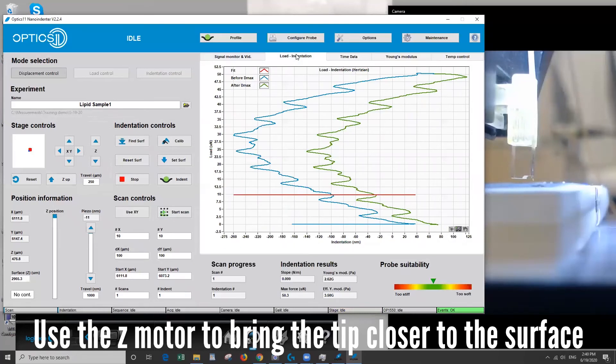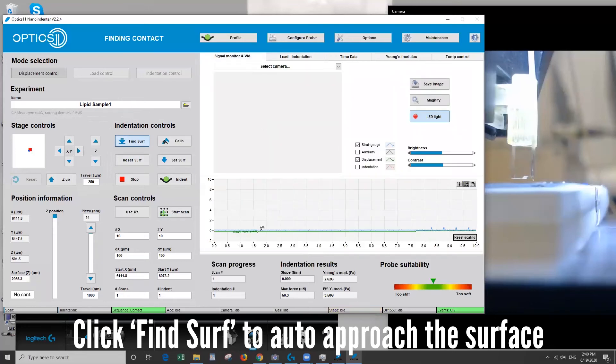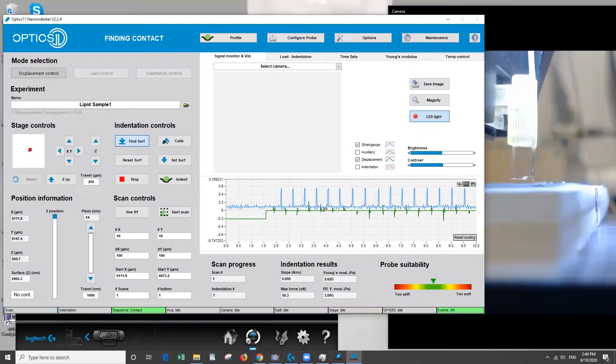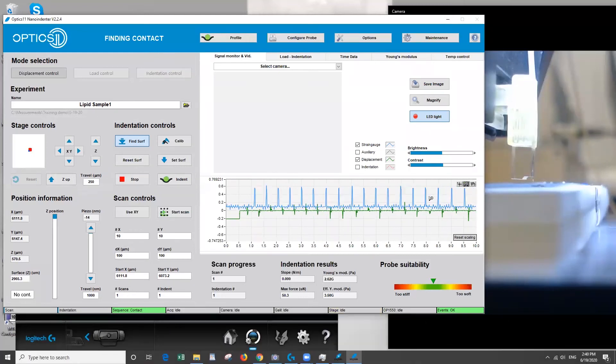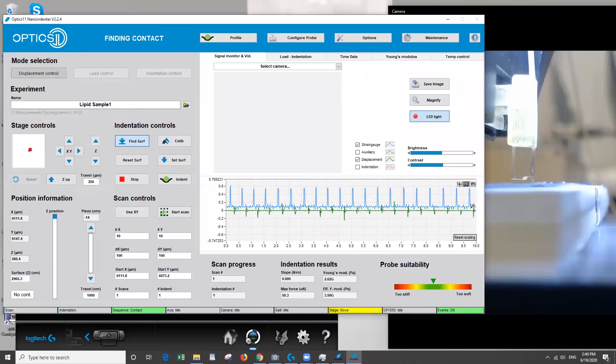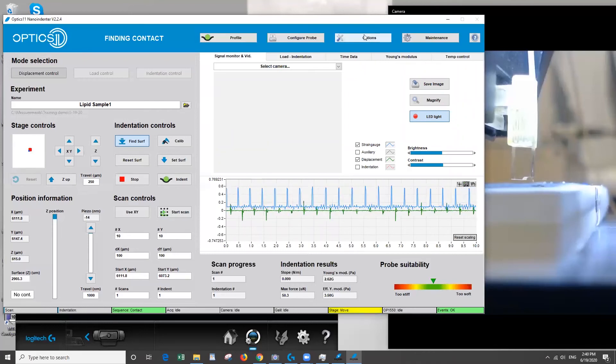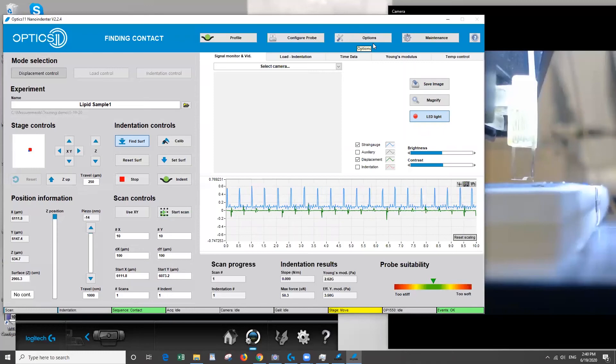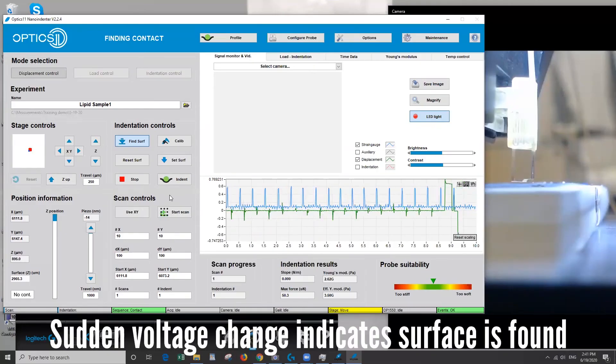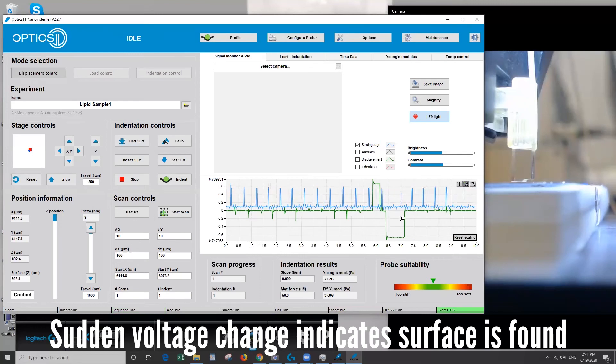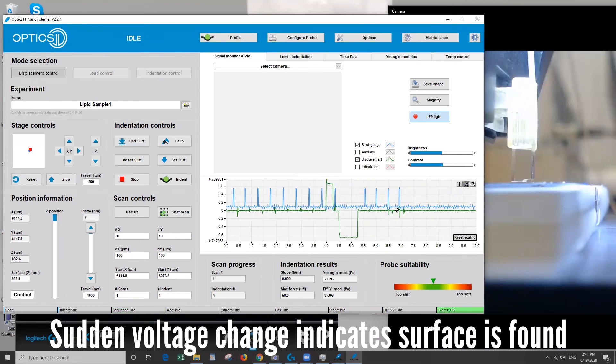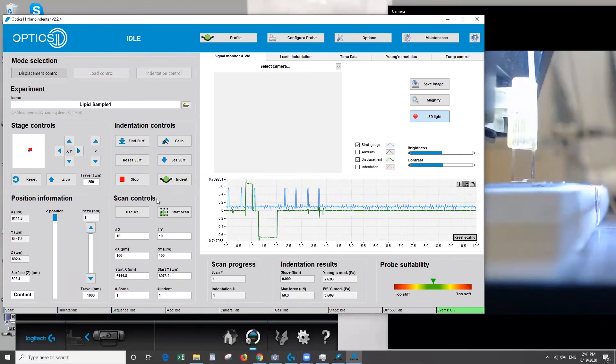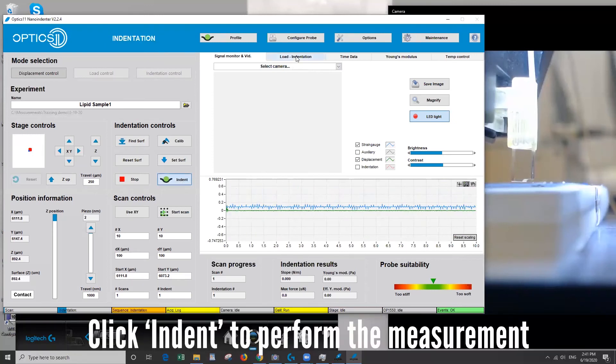And then when we're ready we'll go to find surface. You can see it's taking small steps approaching the surface cautiously and you can change that in the options as well. You see this change in voltage here means we found our surface and you can see the steps have stopped moving. So now we're ready to perform an indent on our sample.